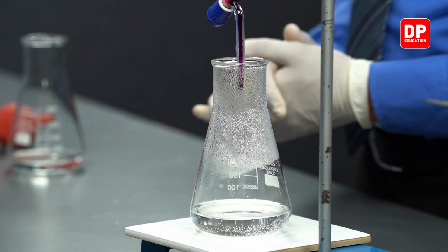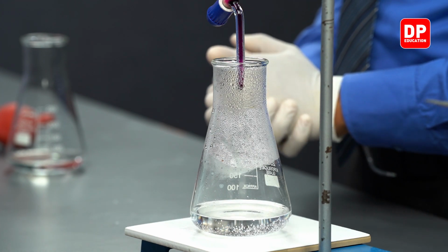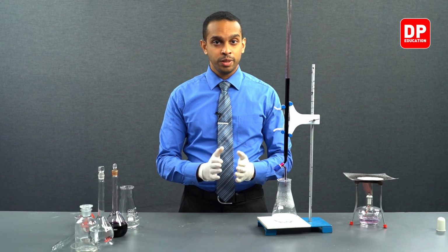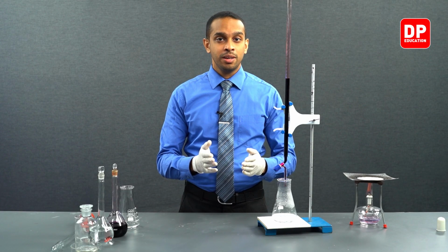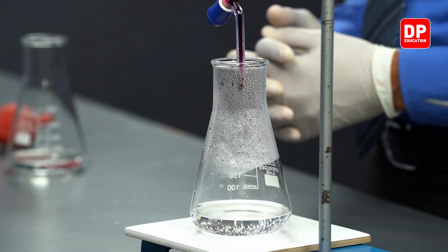Students, now I have added about 27 cubic centimeters of potassium permanganate into this titration flask. From this point onwards, I will be adding potassium permanganate little by little into our titration flask.